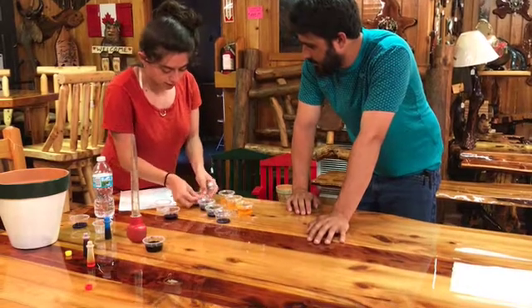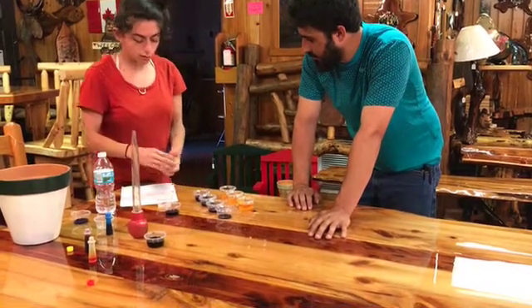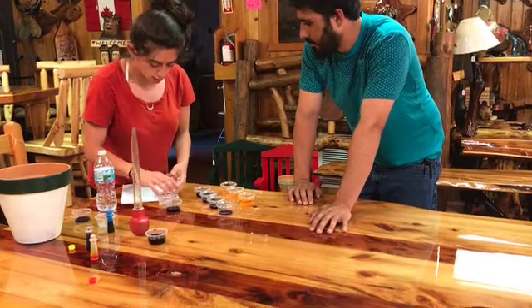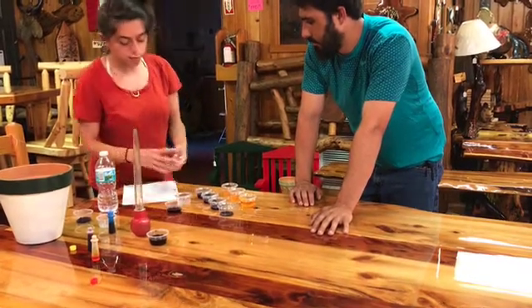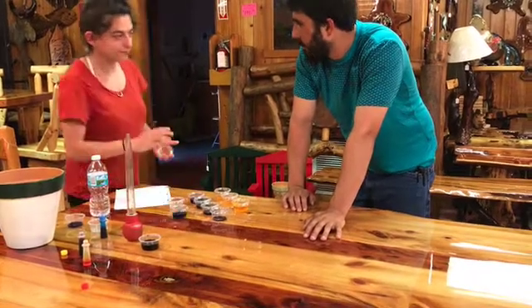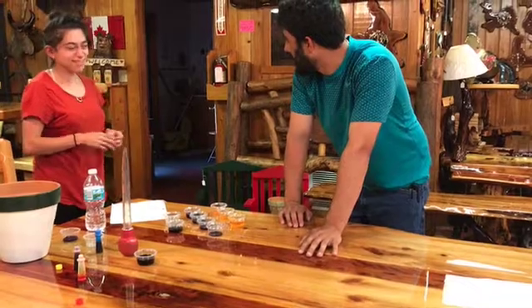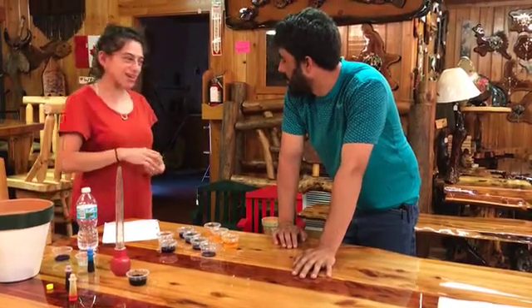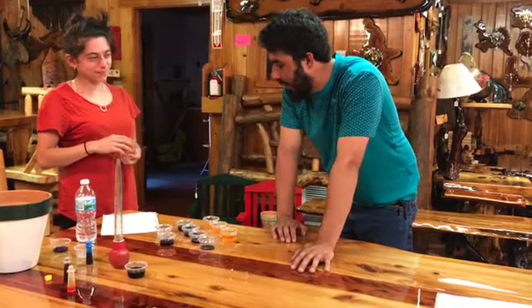So now that we've inverted all of our samples, all 9 of our samples, we are going to let them sit at room temperature for 10 minutes. Wait, how long? 10 minutes. 10 to 15 minutes, actually. But we're just supposed to sit here and stare at it?